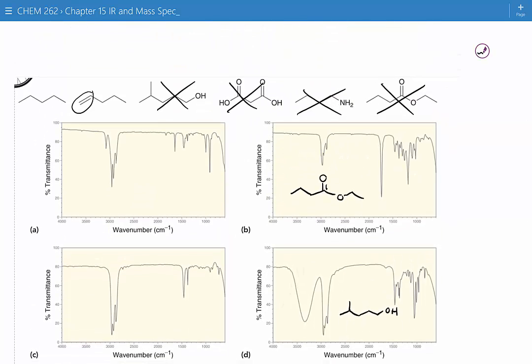So we've got an alkene here, right? If we draw our line at 3000, it's about right there. I know my hands are kind of shaky, so I'll do my best here. This one has an sp2 hydrogen peak, so I'd say this is pretty indicative of our alkene. And if we look at the other one, it's indicative of our regular alkane.